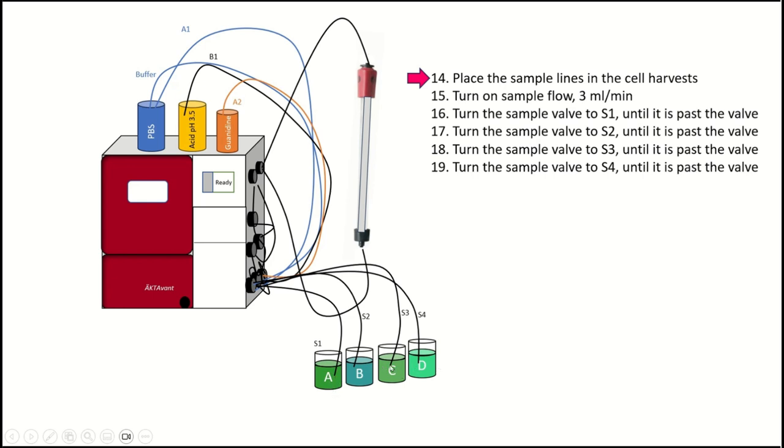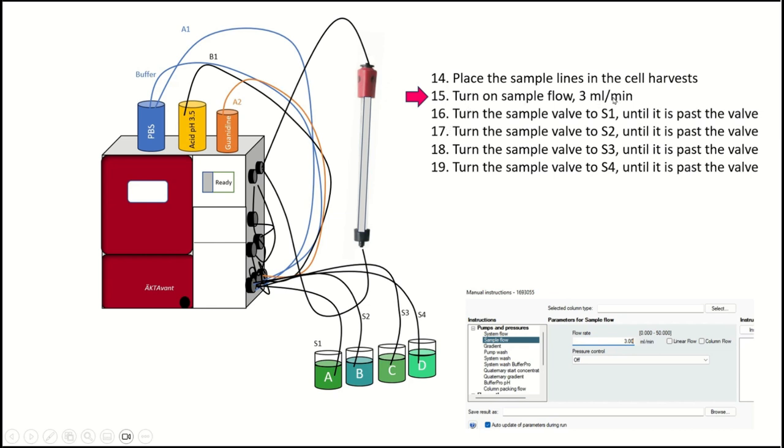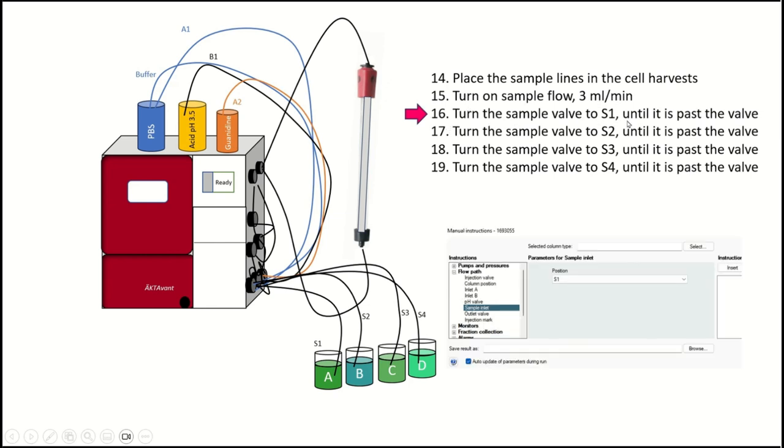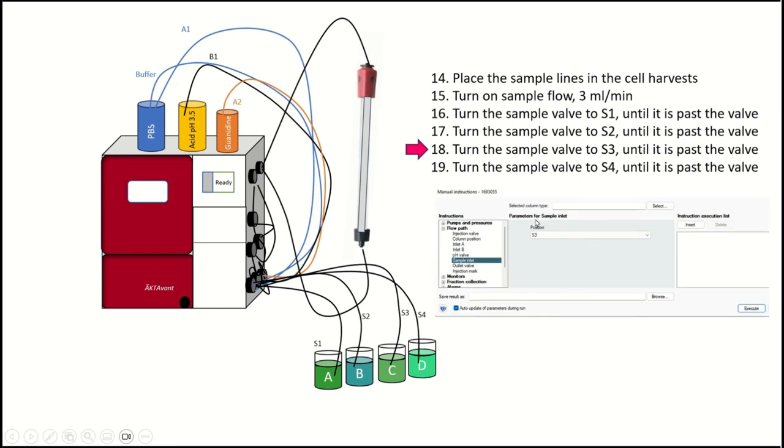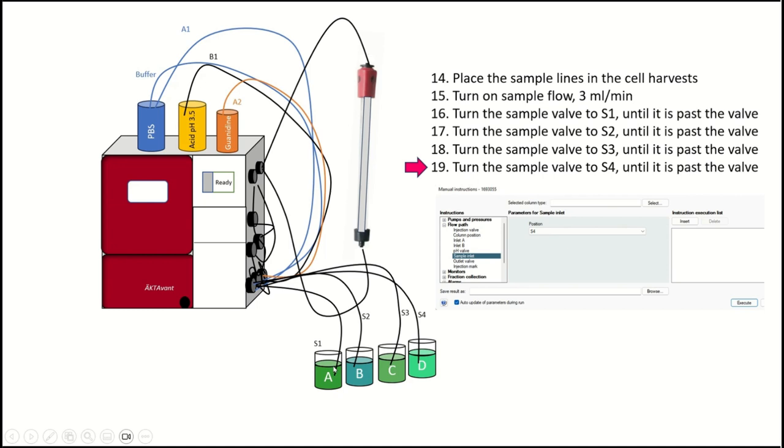Okay. So then when we do that, going back here, just real fast, we're going to not only just place the sample lines in the cell harvest, we're going to make sure they're going all the way to the bottom. So this graphic's kind of hard to get things like perfectly lined up. But we want to make sure all those tubes are all the way in the bottom. Then we're going to turn on the sample flow for three mils a minute. And once we've done that, we're going to turn the sample valve to position one of the sample pump. Then we're going to wait until the bubble, like if there's any air bubble or just the sample is going to go past the sample valve, right? And we're going to do the same thing for sample two, same three thing for sample three and sample four.